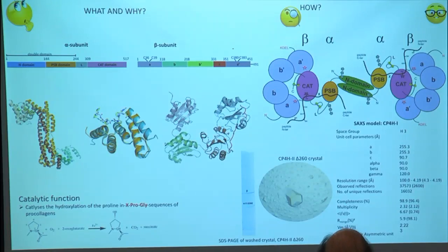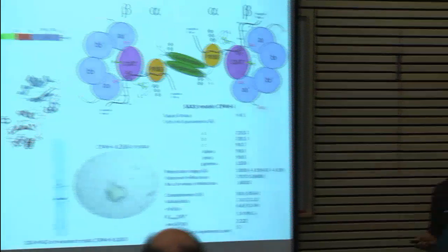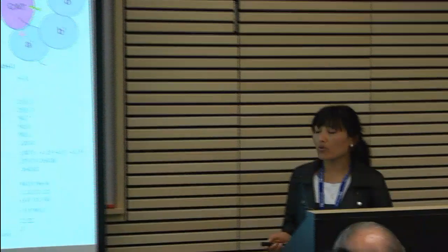together, and from this crystal structure we can understand not only the catalytic mechanism of catalysis of this enzyme, but also it can be used to develop the drug for treating many collagenous diseases, including fibrosis, as well as many metastatic cancers such as prostate cancer and breast cancer.